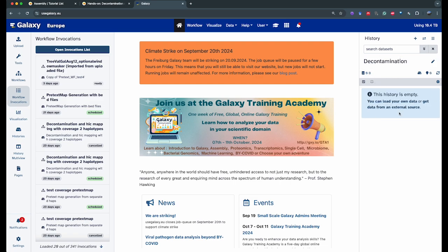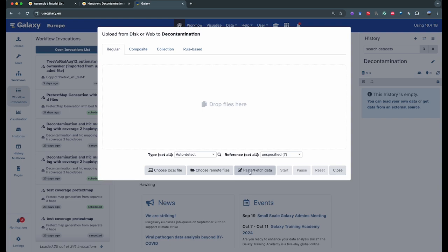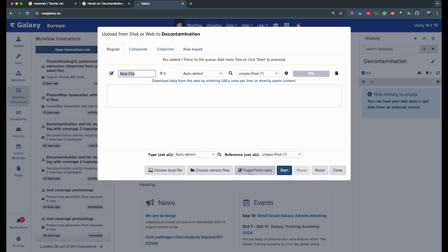Now that we have our history brand new and empty, we're going to go into the activity bar on the left and click on upload data. On the upload data screen, you have different options: you can choose a file from your local browser, you can choose a remote file if you have, for example, an AWS repository connected to your account, or you can use paste fetch data where you can enter a URL, and that's what we're going to do.